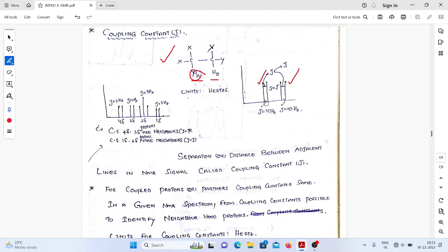So whenever we have two lines, three lines, four lines, we already know singlet, doublet, triplet, like that we had a discussion, right? If you see this one, we have two lines in the signal. It means it is a doublet. In case of the doublet, the intensity ratio of the signal is 1:1 according to the Pascal triangle. Okay, so if you observe this one, we have two lines. In between the two lines, we have some space or not.